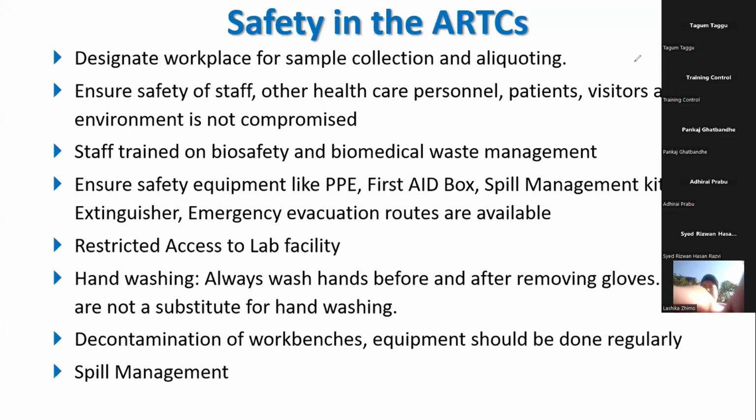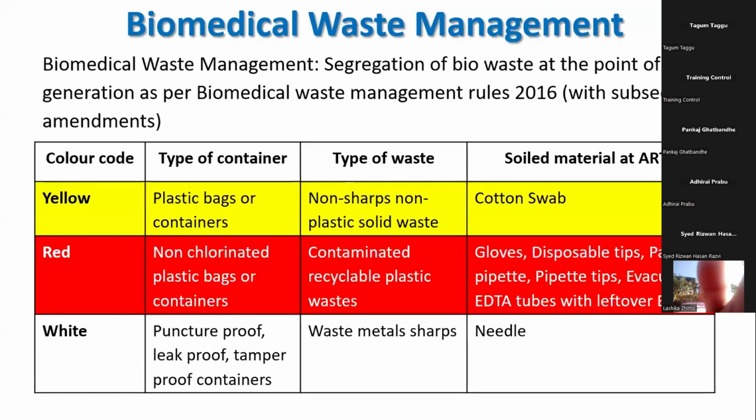Decontaminate your workspace and process the spill according to the spill management criteria. There are three kinds of bins or color-coded bags. The yellow bags are for cotton swabs. The red bags are for gloves, disposable pipettes, pipette tips, or vacuum containers with leftover blood.